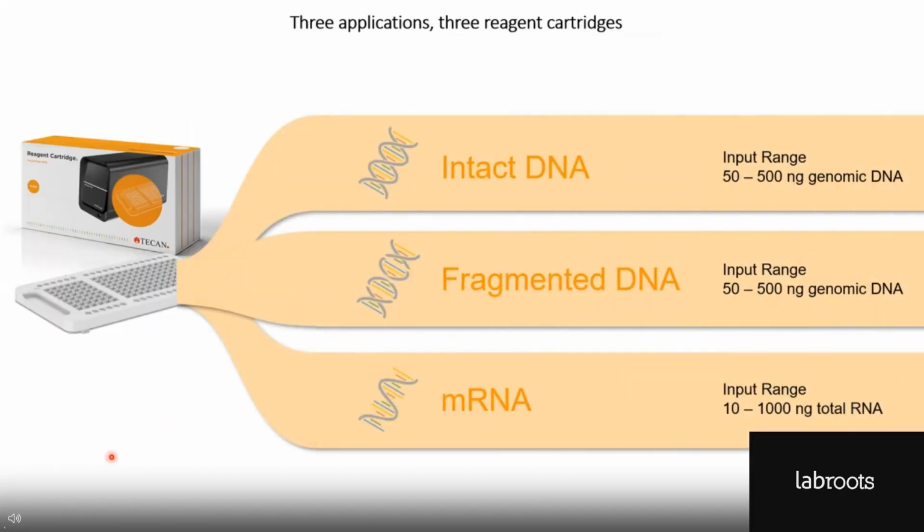So it can also do intact DNA, it can also do fragmented DNA, it can also do mRNA. And so we've done quite a bit of work with this, and so we're fairly consistently surprised as to the quality of what we can get out of this.